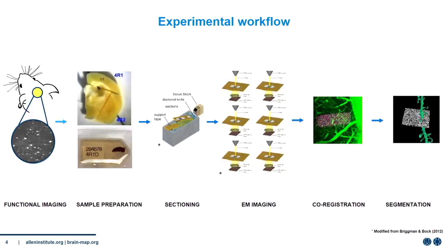Those thin sections are then collected and put into the different TEMCAs and imaged with high speed, high throughput. Finally, the EM images are stitched in a line and co-registered with the physiological data before they are sent off to Sebastian Sung's team at Princeton, where the final segmentation and 3D reconstruction happens.